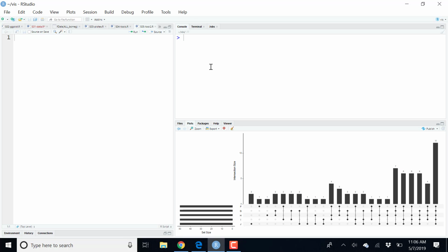Okay? And so the next step would be to combine, maybe based on my plot here, this 3, 5 plus 4. Next step would be to combine 1, 2, and the last step would then combine all the samples.